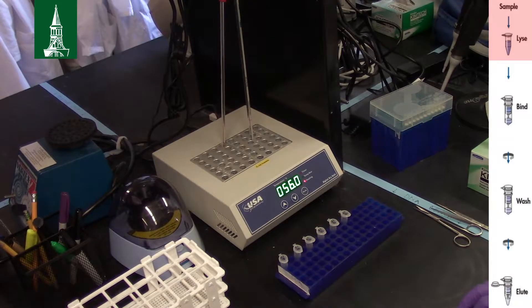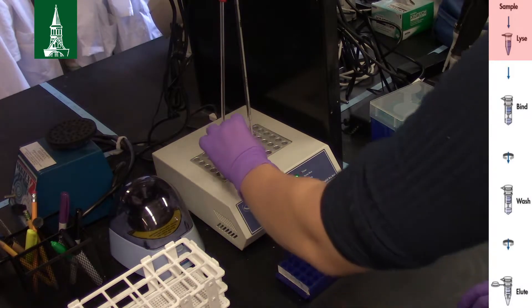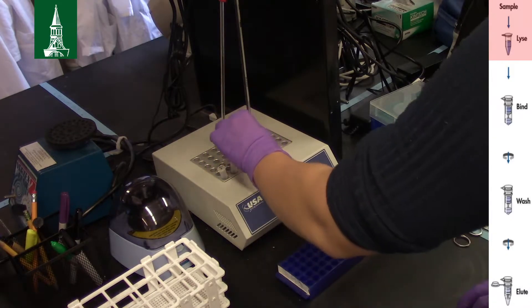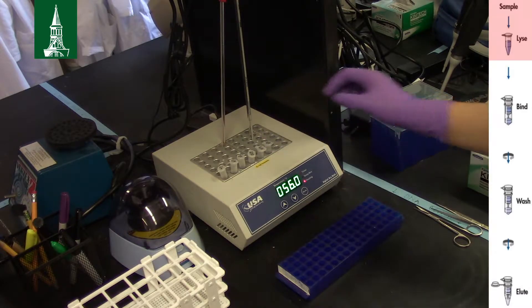Incubate at 56°C until the tissue is completely lysed. Vortex occasionally during incubation. For example, for urchin epidermal tissue, incubate for an hour, vortexing every 20 minutes.